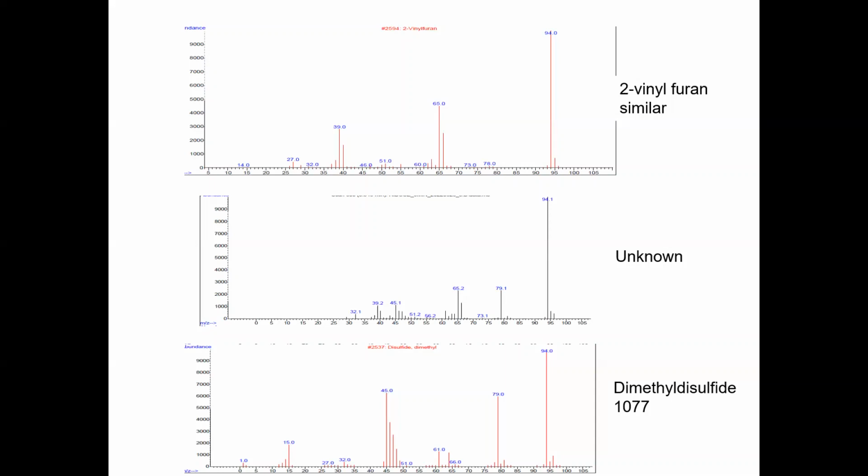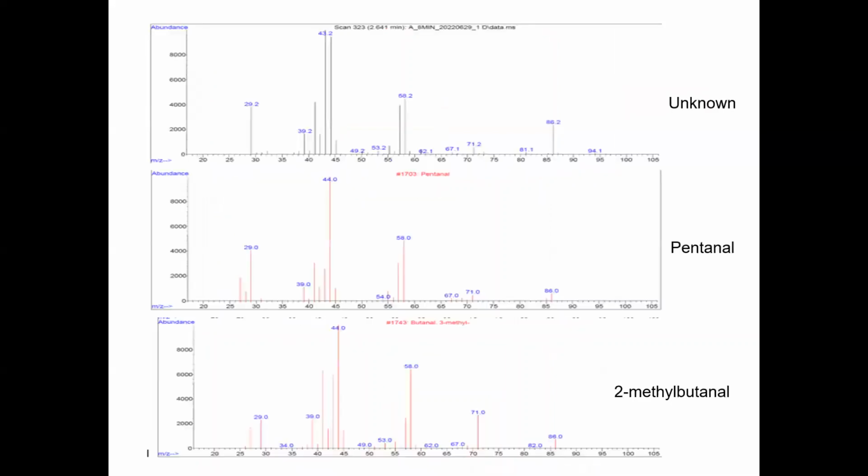This 45 down here will contribute this. So if you put the 2 together, a 65 goes in here, 39 fills in here, 45 again. You actually get your spectrum here if you put these two together in some combination of amounts. And so what would you do about that? Well, wait a minute, I'll come to that in a moment.